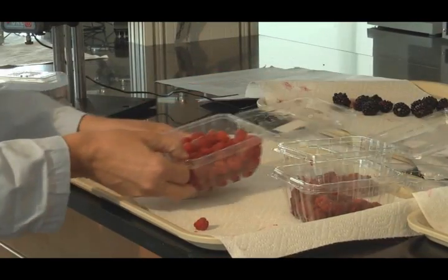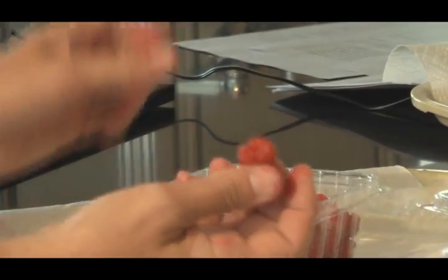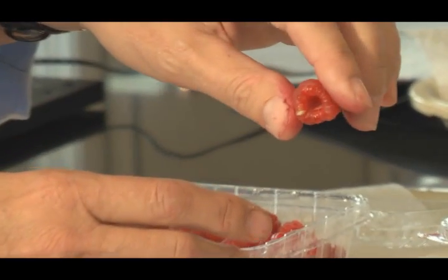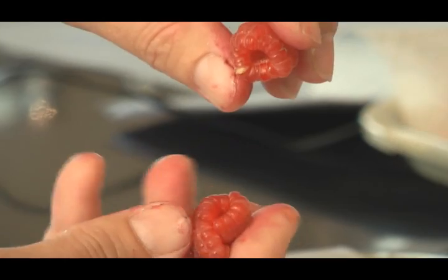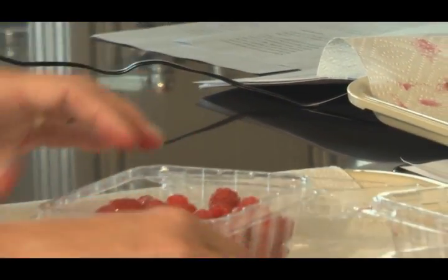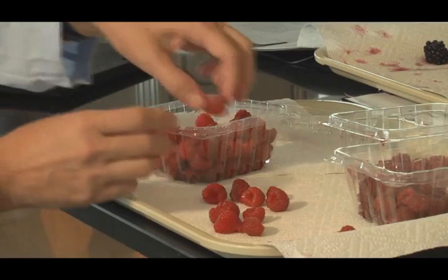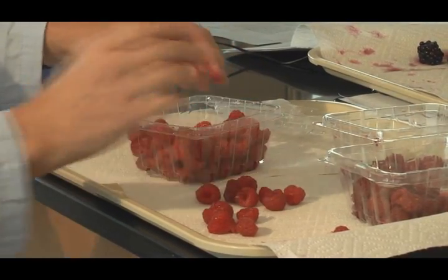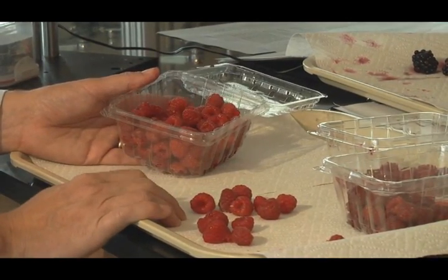The next thing I do is take these out individually and determine firmness on them. A firm one doesn't have as much give when you touch it — it feels firm in your fingers and it's not pushing in when you push. Whereas a soft one, the calyx starts to close and reopen when you press on it. It's just a matter of going through the whole pack and determining whether they're soft or firm. In the data sheet, you'll write down the number that are firm and the number that are soft.